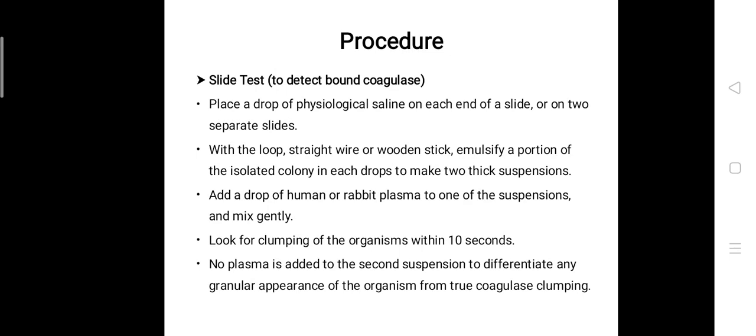Draw a circle on the underside of the slide designating the area where the test will be performed. Label one 'T' and other for the normal saline control. Place a drop of normal saline on each end of a slide or on two separate slides. With the help of the inoculating loop or straight wire or wooden stick, emulsify a portion of isolated colonies in each drop to make a thick suspension.